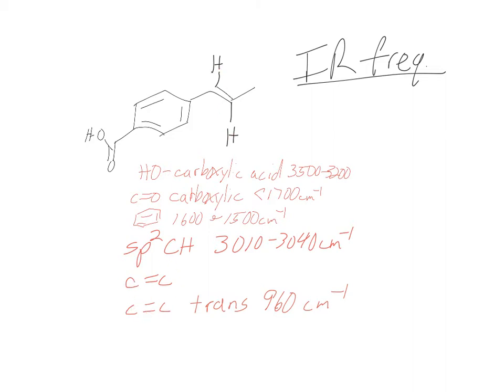Where's the actual C=C stretch? Just a normal C=C stretch. Where is that? 1620 to 1680. So you also have a 1620 to 1680. Now, that might overlap with this one as well, but you're expecting possibly it to be there. The one that's really indicative, that you really want to look for, is this trans one.